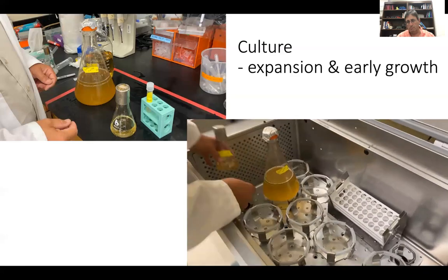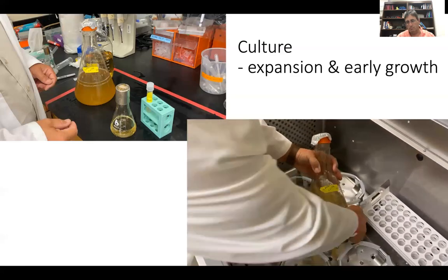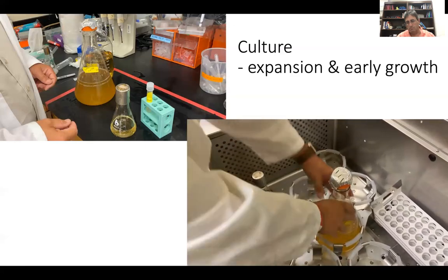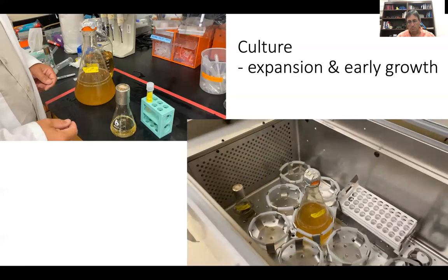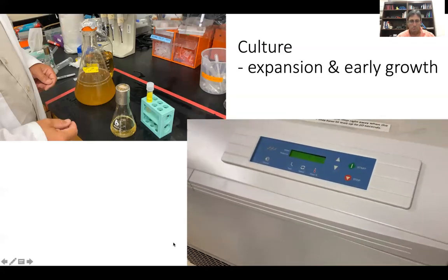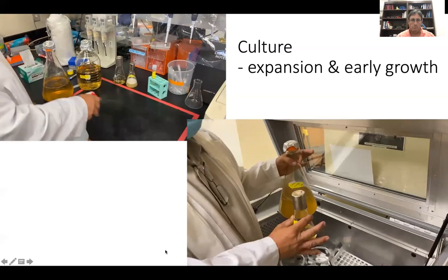There we go. Making sure that your flask fits securely and snugly, not loose and wobbly. Those start. All right, so we let those go over.